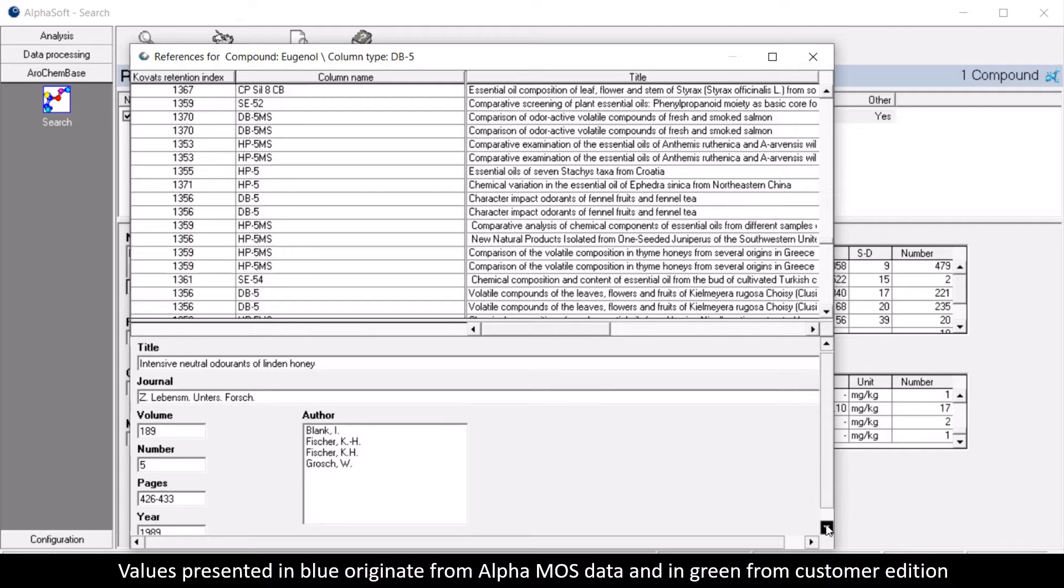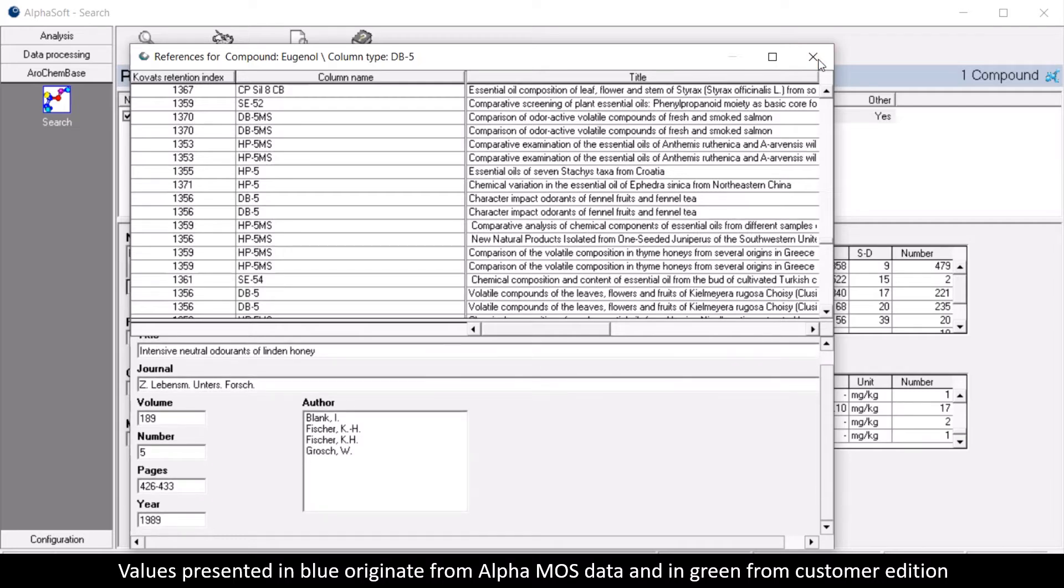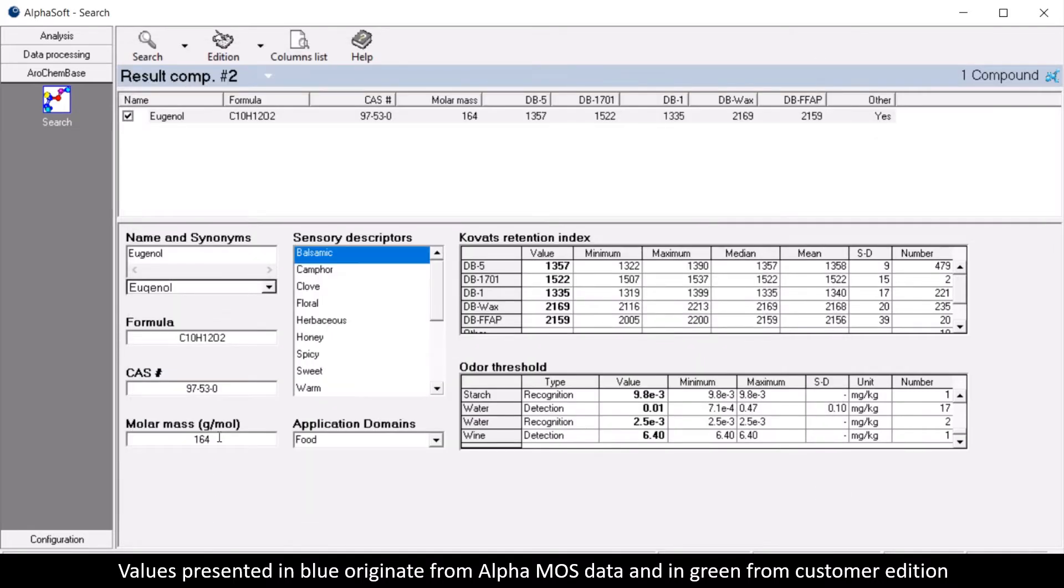Values presented in blue originate from Alpha MOS data and in green from customer edition. The individual values of Kovats can be visualized by double-clicking on the line.